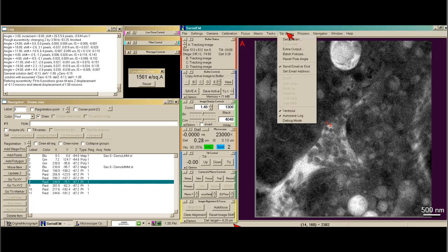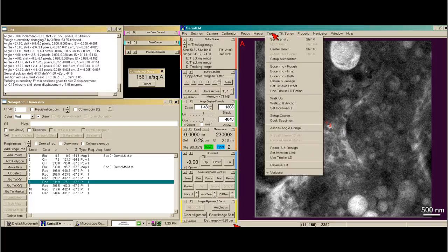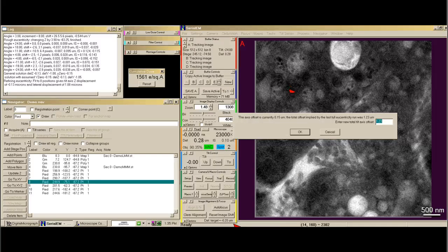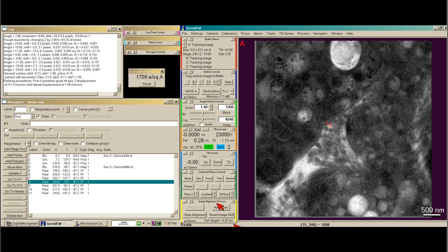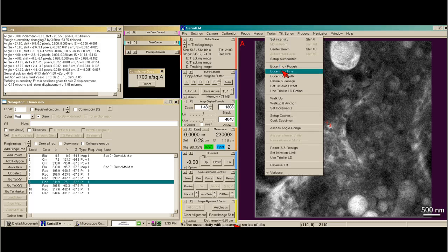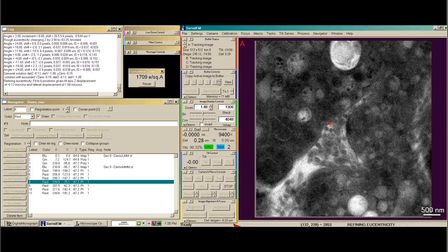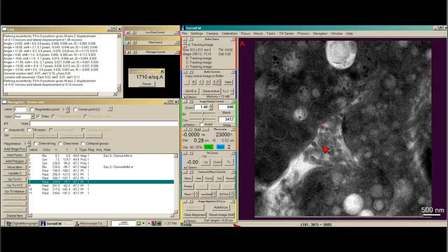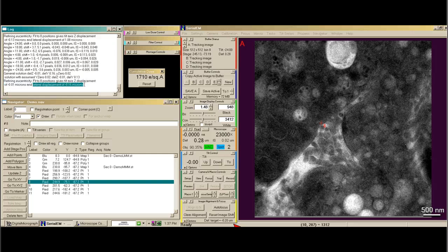If you want to correct for this, you go on the tasks menu and say set tilt axis offset. Then it calculates what the new offset will be. I usually run fine eucentricity again so that I can double-check that everything worked out, because every once in a while, if you have a funny structure that it's imaging, especially in cryo with big chunks of ice, it will actually throw off that calculation. Fine eucentricity has just finished again, and our lateral displacement is much closer to zero, so I'm happy with the results.